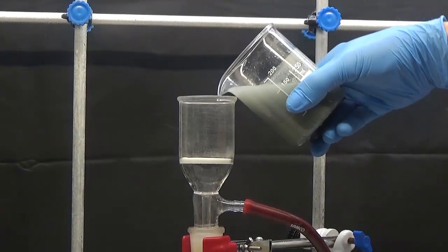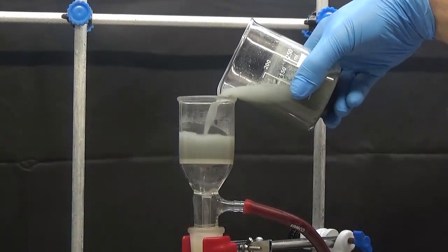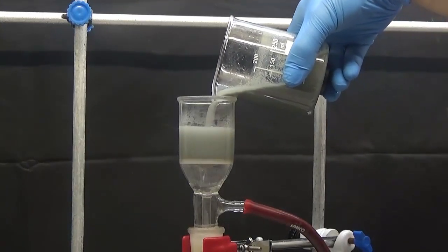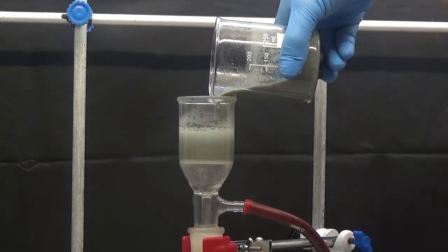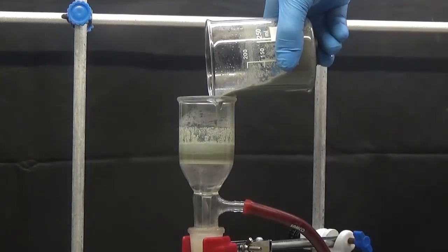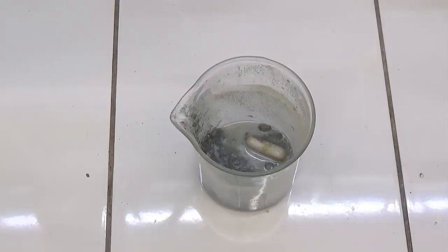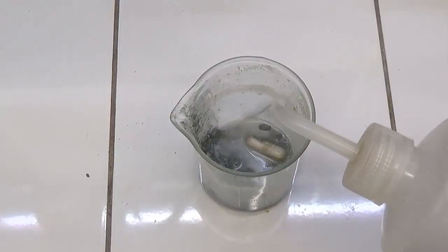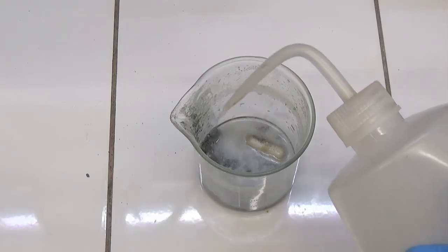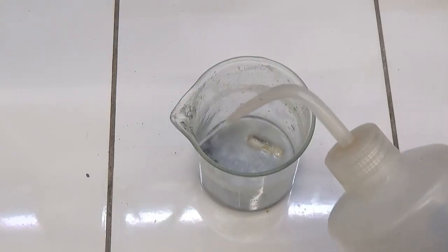Once all zinc has been added, filter to remove the unreacted zinc and thoroughly wash the residue in the funnel twice with cold water. The yield depends on the zinc washing that did not react, as furfurylamine hydrochloride is trapped in the pores.